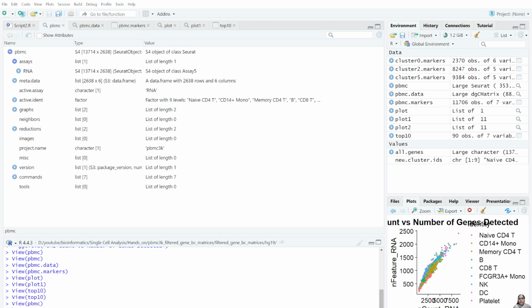There are so many. For spatial transcriptomics, we also have another layer with a matrix for the coordinates of where a particular cell is, and a layer of images, histopathological images. So there are different assays that can be present in a Seurat object.